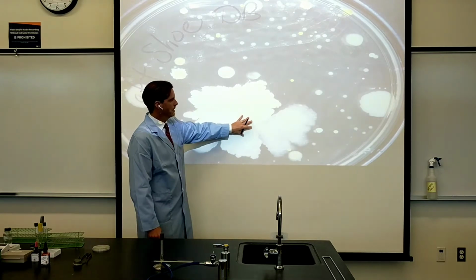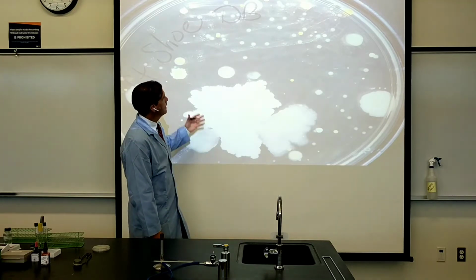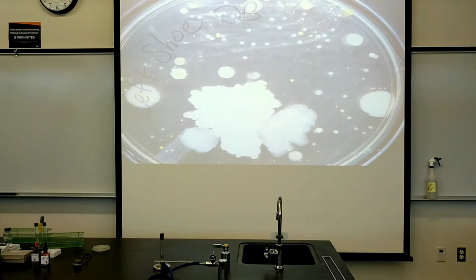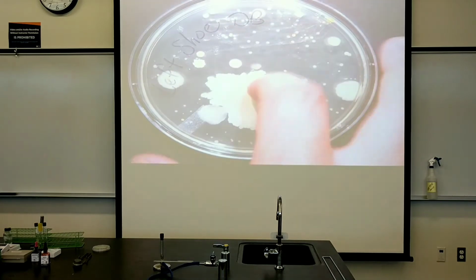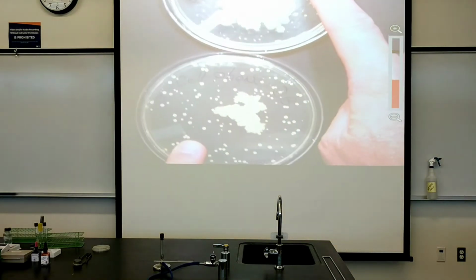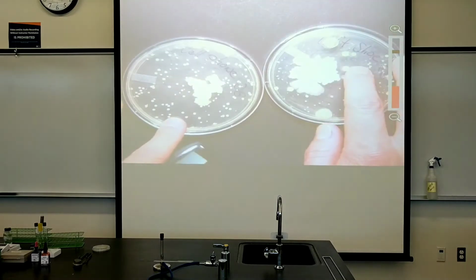These bacteria that are irregular in size are typical of soil-based bacteria. This looks like a soil sample, and there's no surprise that with the variety that comes from a soil sample, it would look just like the bottom of my shoe. Let's compare that to my cell phone. So the cell phone, okay, I'm going to try to get both in the picture.